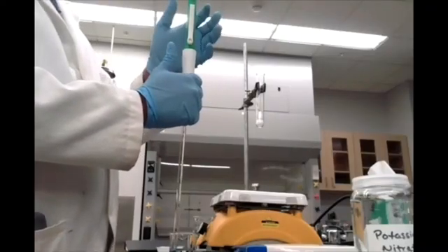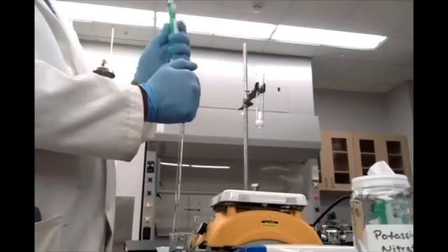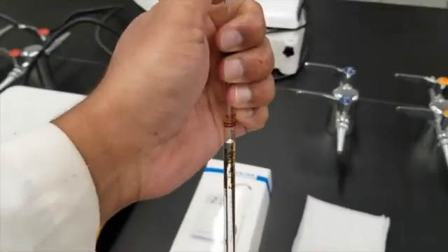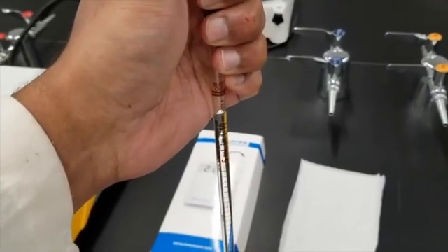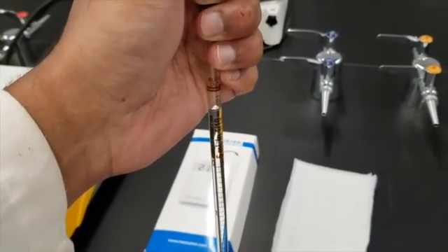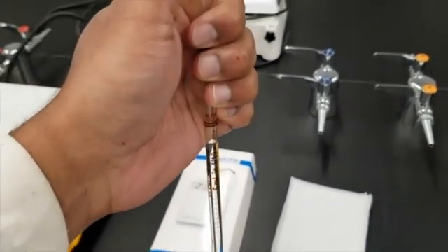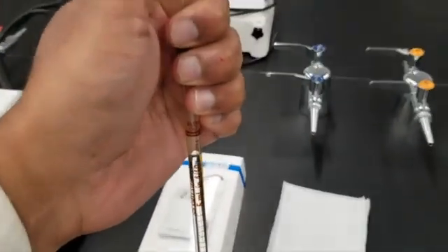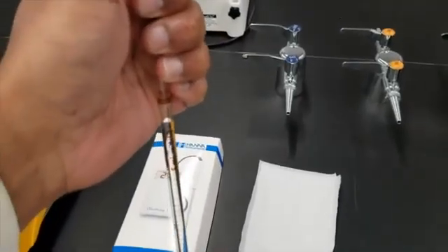You want to be careful not to pull it to the side, or you don't want to break the glass. So pull that up and immediately put my thumb on this opening here. All right, so I noticed two things. One, it's hard to show this while handling the webcam, especially with its poor focusing, so I'm using my phone here. Secondly, I noticed that I was able to get a better seal on the pipette with an ungloved hand, so I decided I'd take off the gloves there to show that to you.